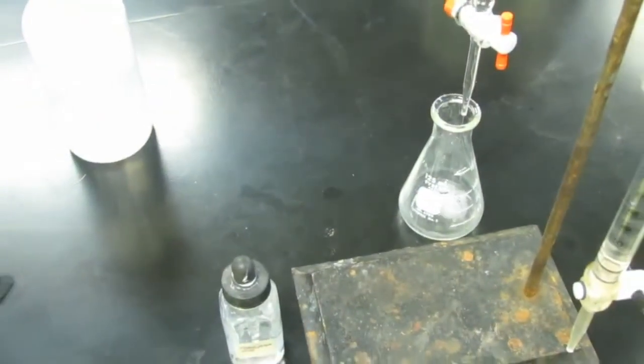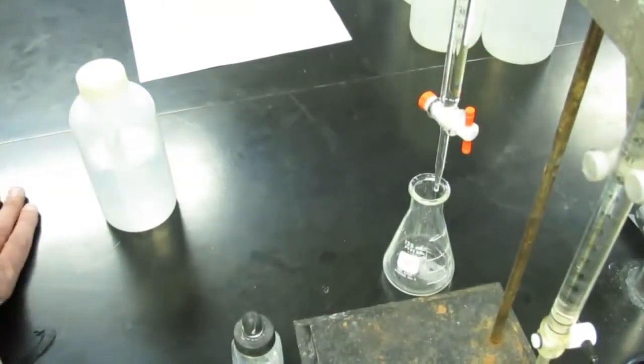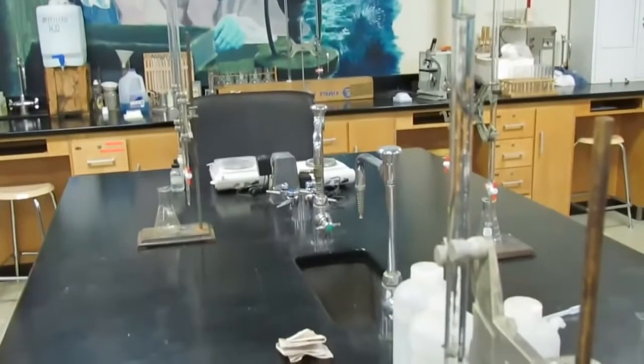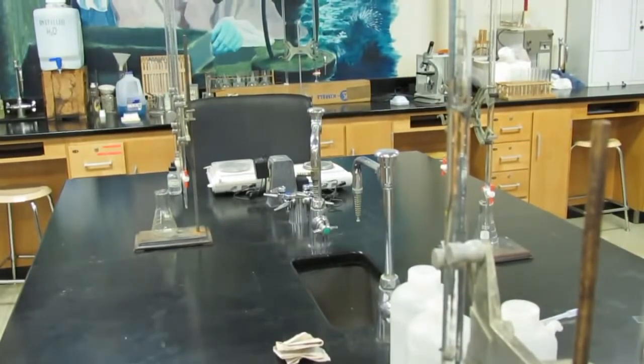I'm not sure if you can see that or not. We want to get approximately 25 mils. I'm going to stop this right around the 26 mark on my burette. I'm not sure if you can see it draining there. So we'll stop it right around 26, give or take a little bit. It's not really that important. So we have approximately 25 milliliters of acid in our flask.